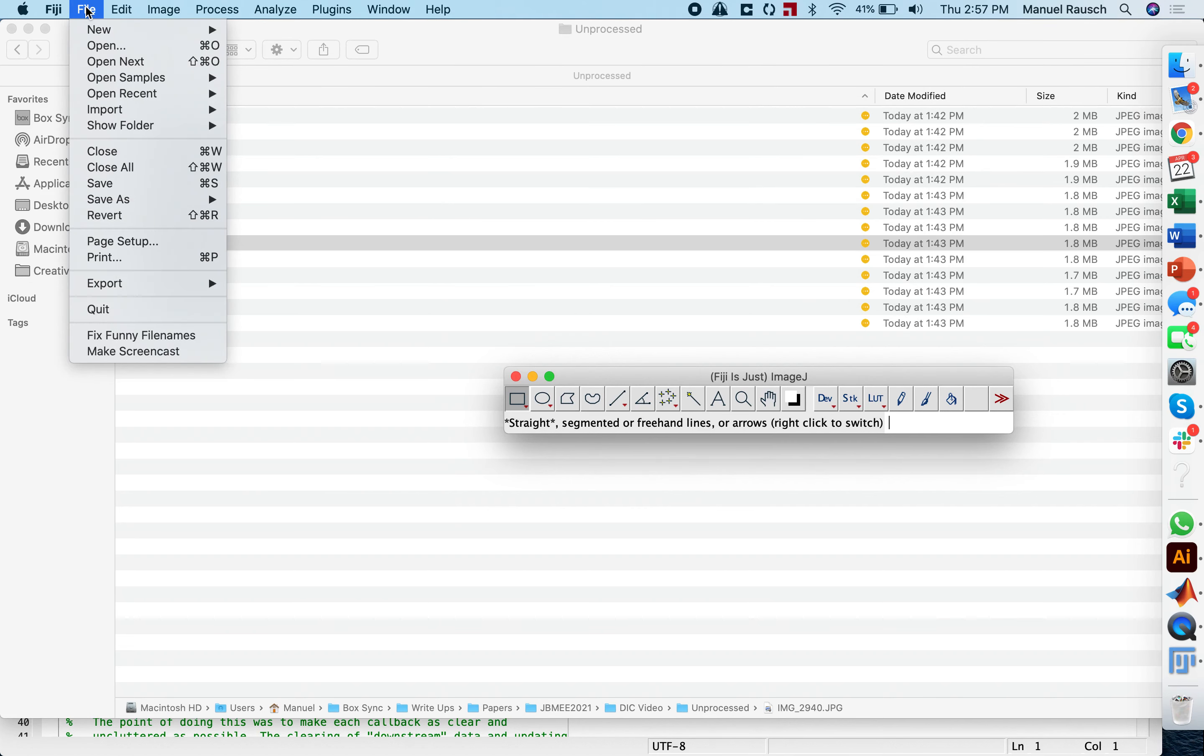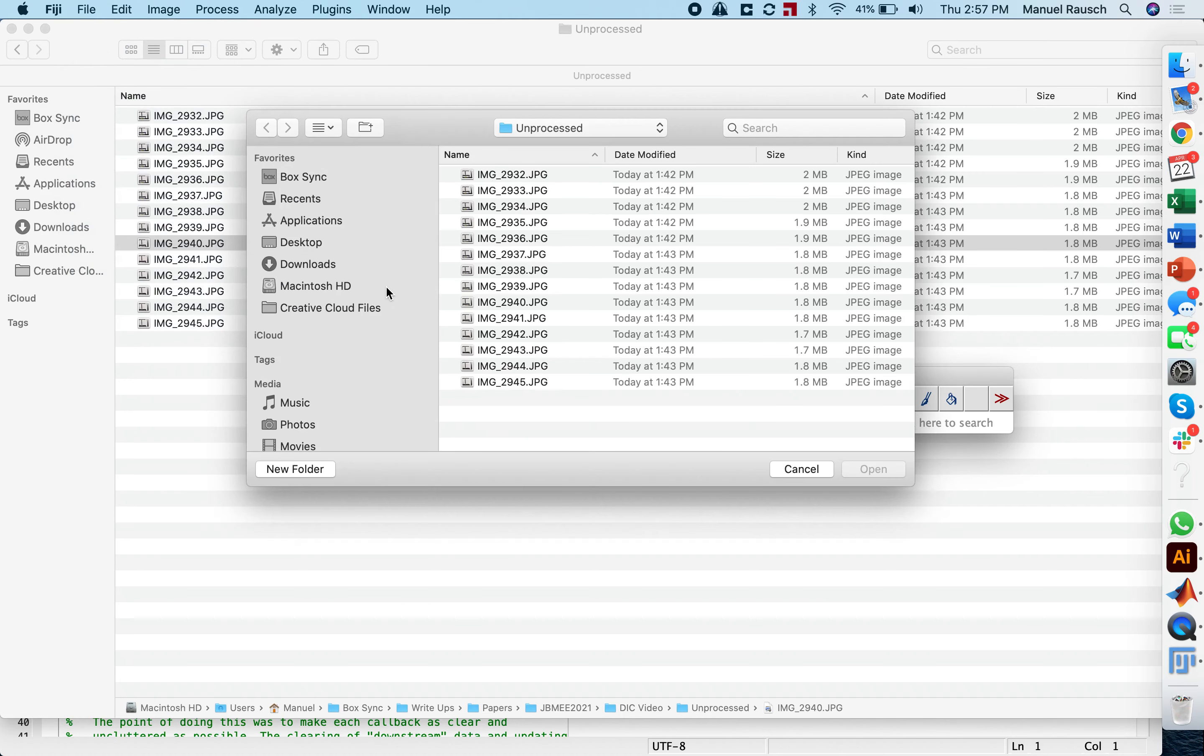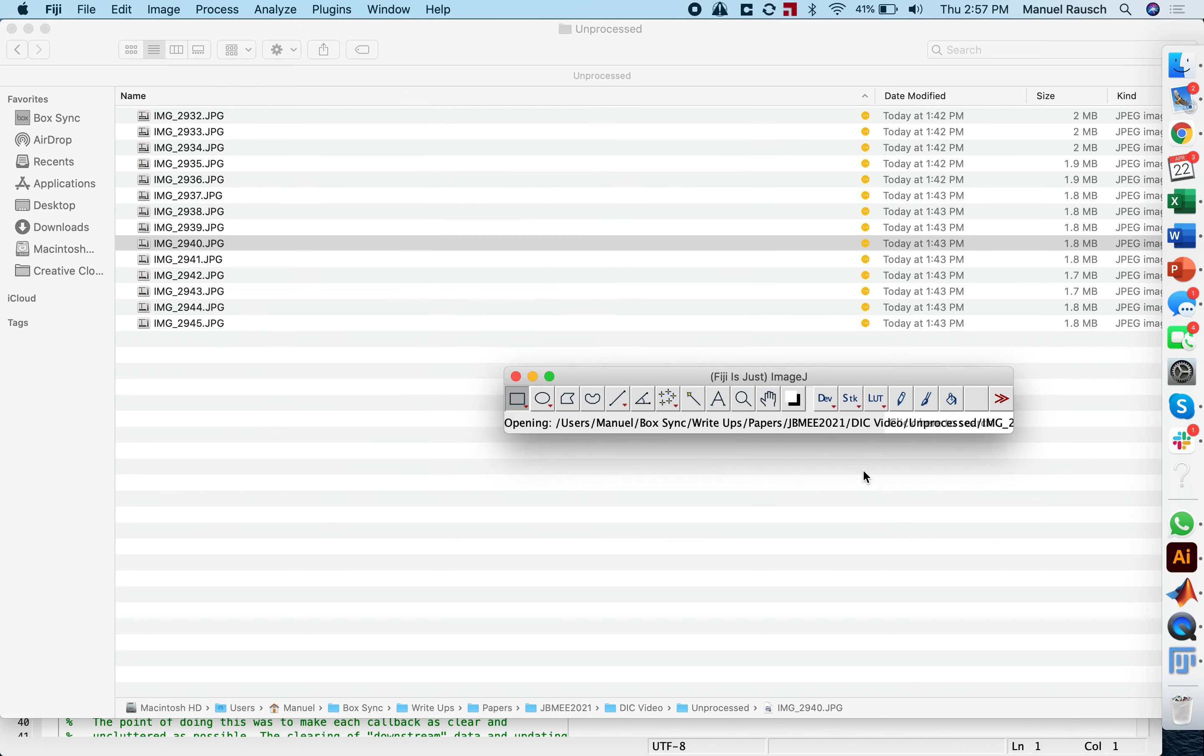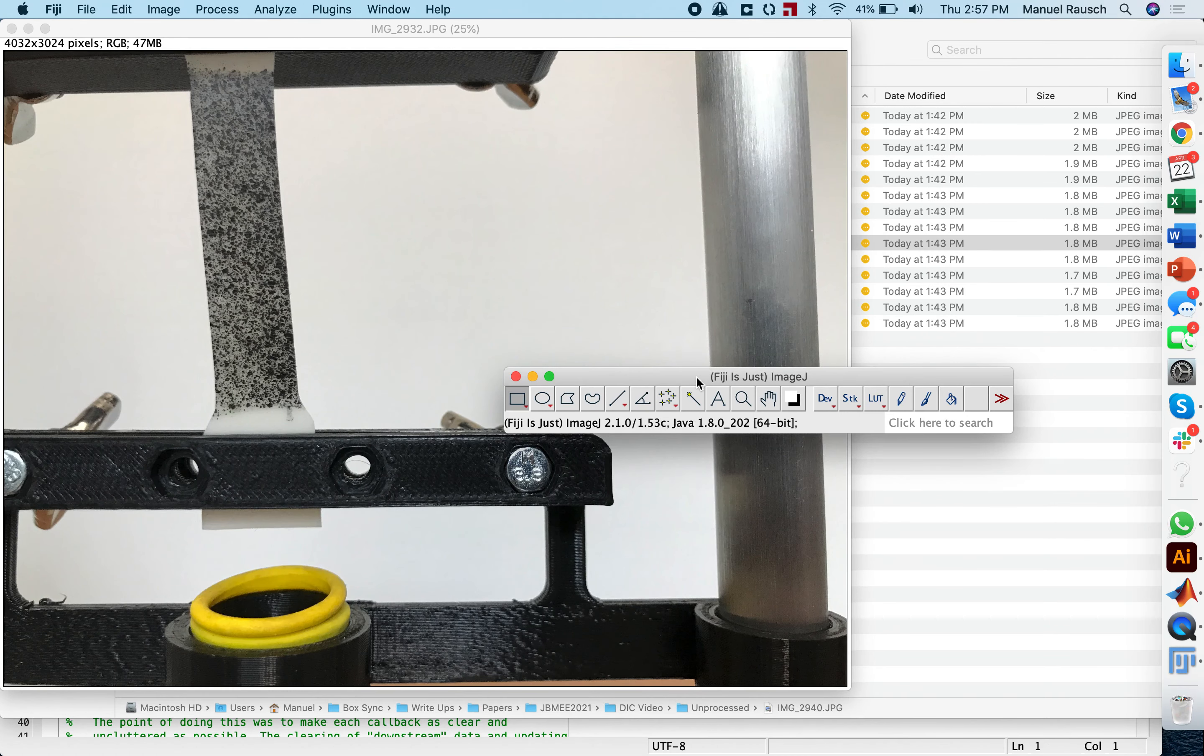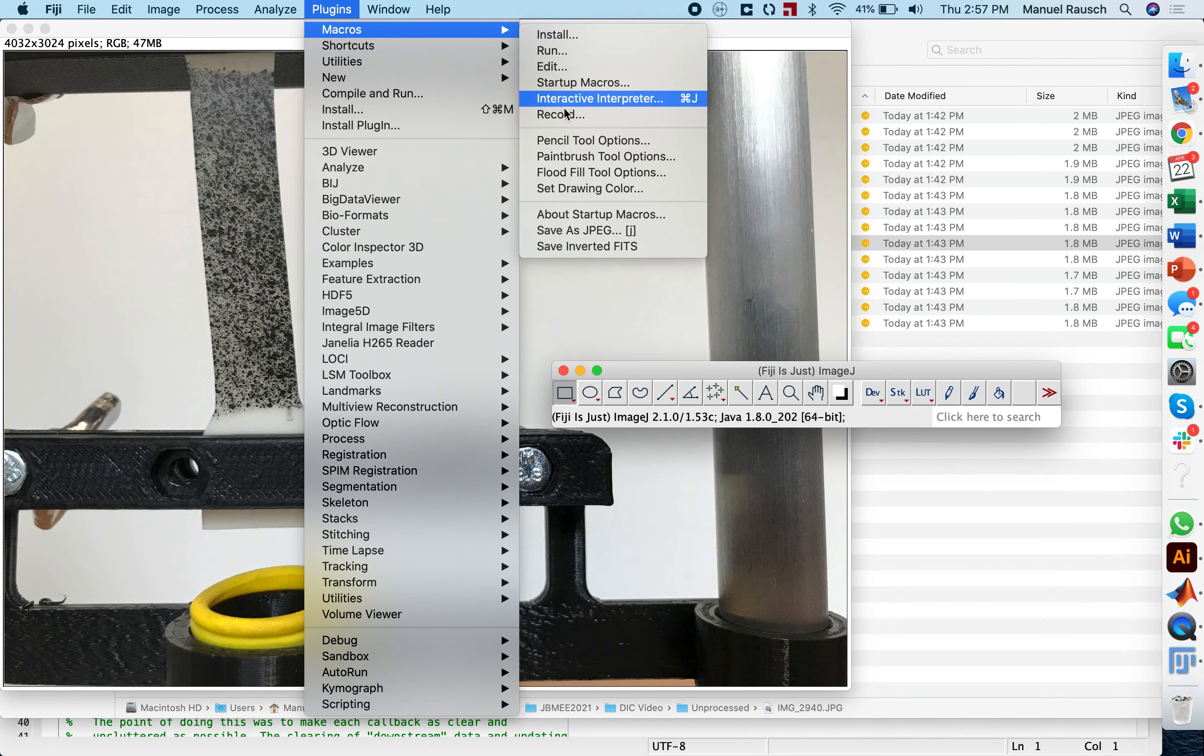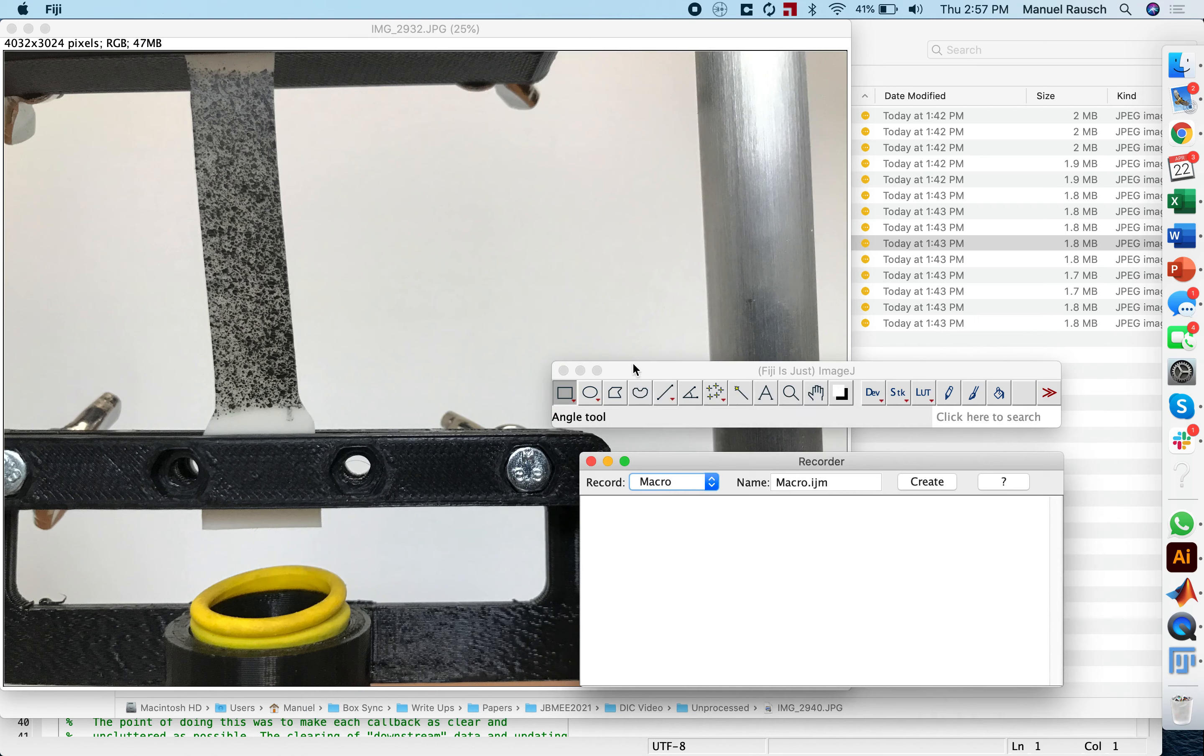As a first step, we're going to actually open one unprocessed image and teach Fiji essentially how to crop these images. To this end, we're going to go under plugins, macros, and actually record the couple of steps that we have to take for this.